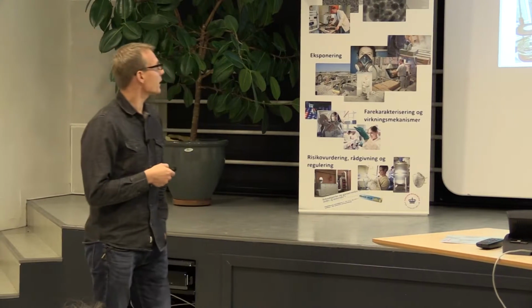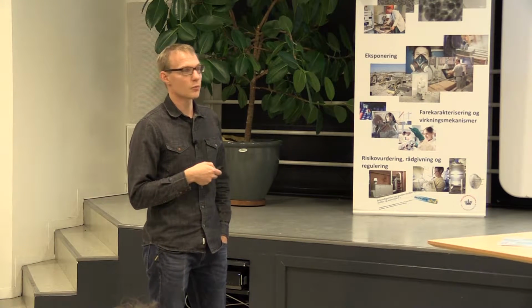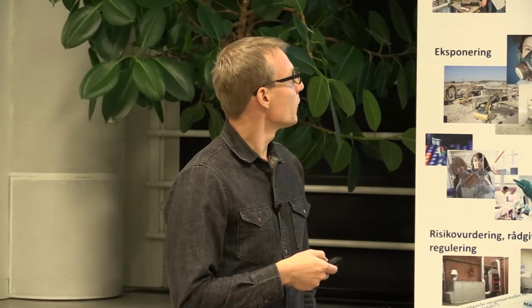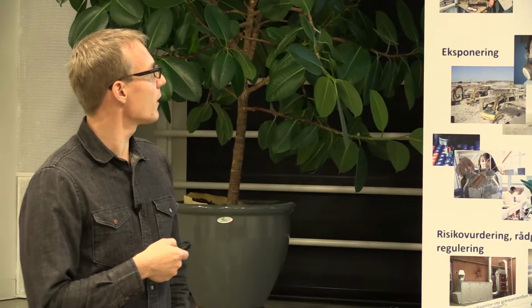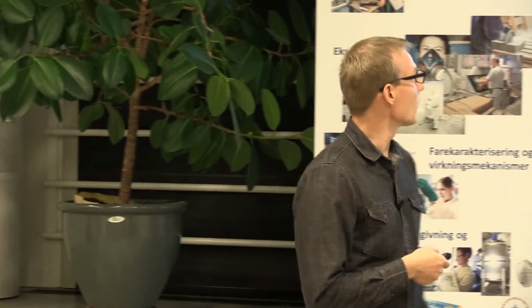And we are lucky in this case, because the diffusion charger signal is also proportional to particle diameter. So it's a kind of lung deposited surface area monitor. This is one such surface area monitor, the Disc mini, which is handheld. We used this Disc mini to measure exposure levels in polypropylene injection molding, tungsten carbide cobalt fine powder production, handling of nanodiamonds, fishing lure manufacturing, and jet engine emissions. These are the scenarios which I show.